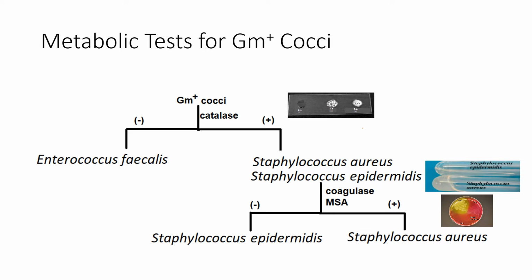So not being able to ferment mannitol does not mean it can't ferment anything. I cannot make that determination. So we are very careful on what we will agree to say yes or no to. Frankly, in the end, knowing whether or not Staph epidermidis ferments or can't ferment, that's not a big deal.